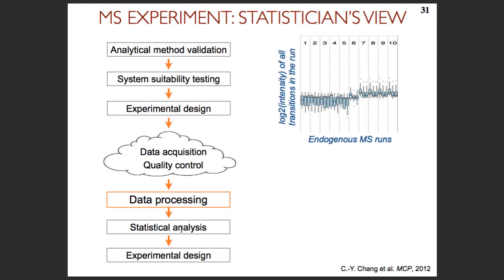Any questions so far? So MSstats can decide which method to use. So if the identifier appears more than once, then it can think it's repeated.